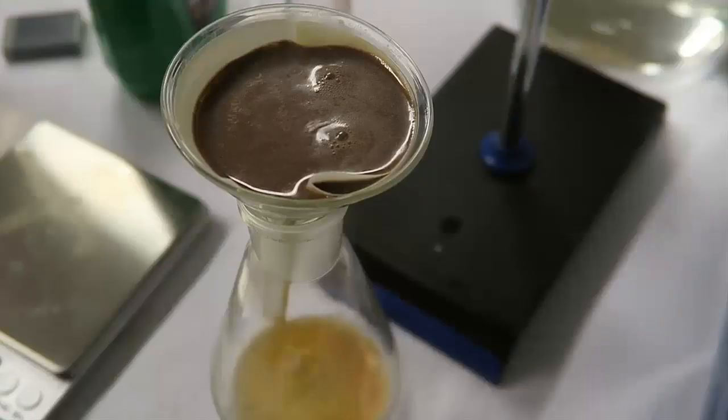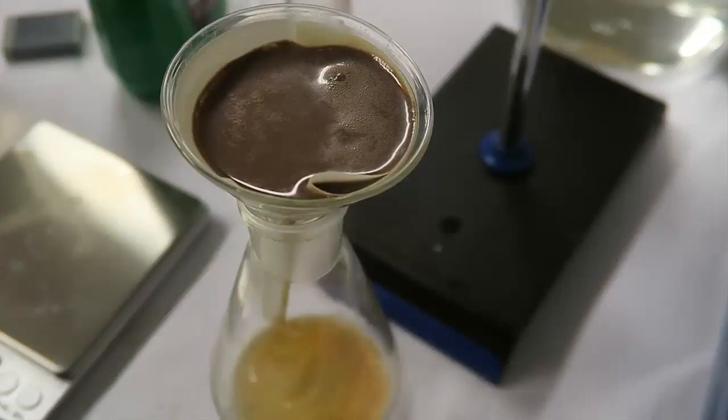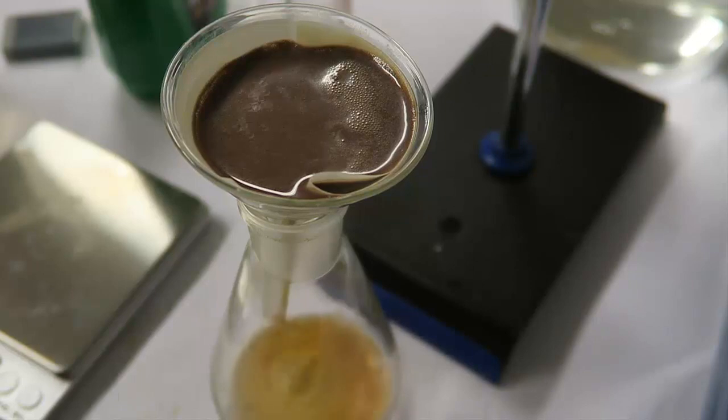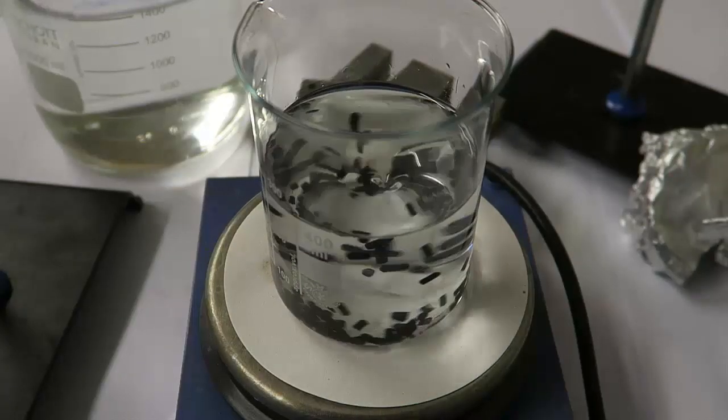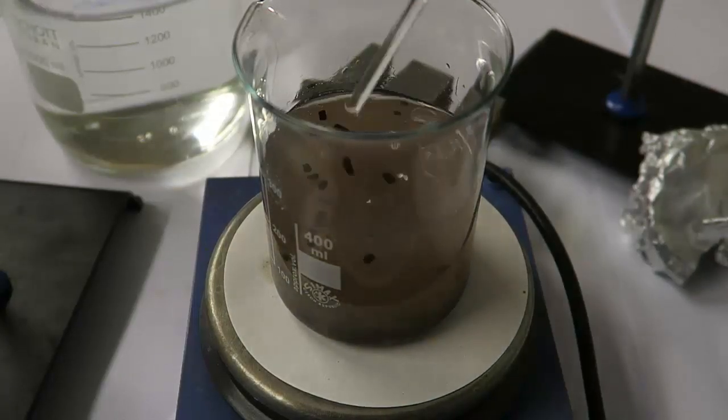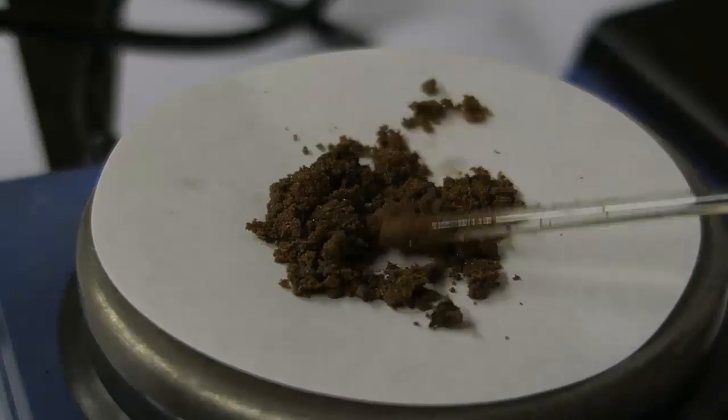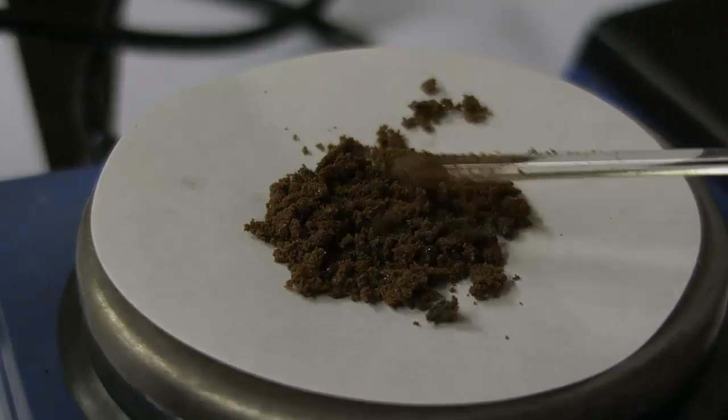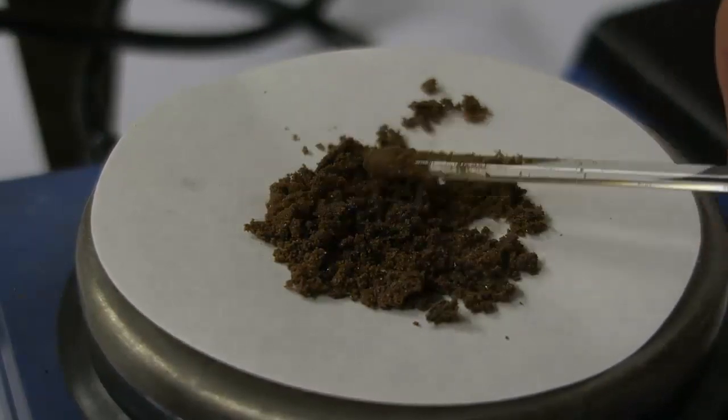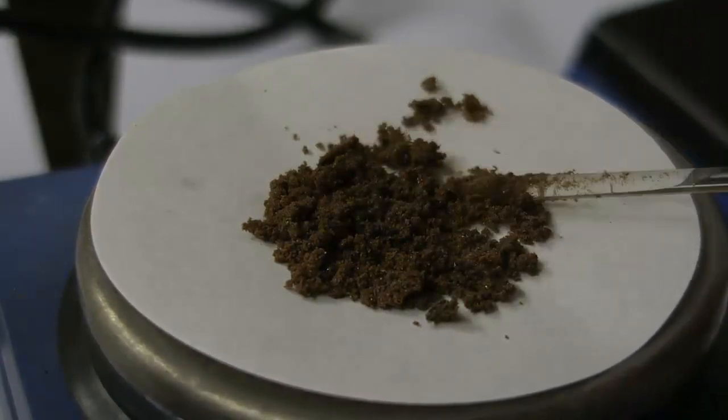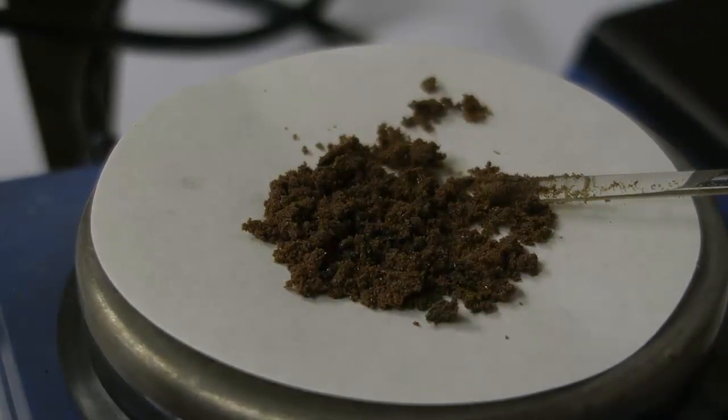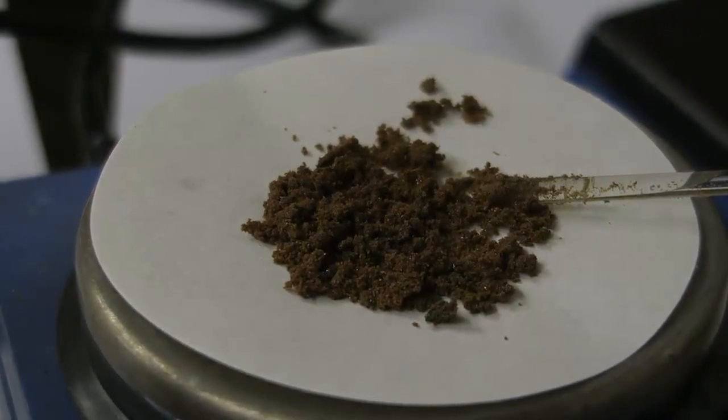The crude anthranilic acid can be then filtered off. It's then recrystallized in hot water. I also added some activated charcoal, trying to get rid of the colored impurities. At the end, I was left with a really bad yield of 47%. Also I couldn't get rid of the color, even though I recrystallized it multiple times. My overall yield, starting from phthalic anhydride, was around 40%.